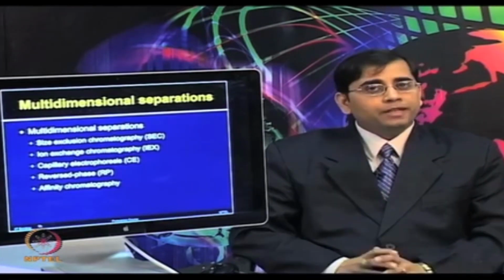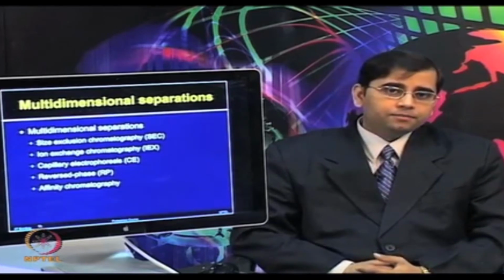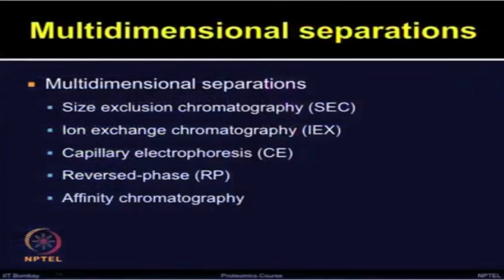Different principles are involved in separating these peptides. One can use size exclusion chromatography, which separates based on molecular weight or size, ion exchange chromatography based on charge, capillary electrophoresis based on charge, reverse phase based on hydrophobicity, and affinity chromatography, which is based on biological interactions.